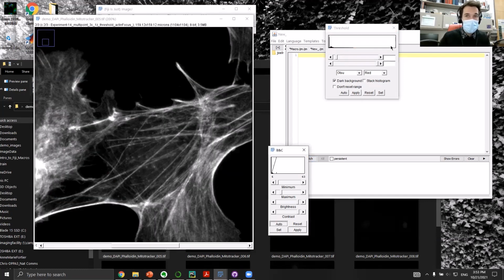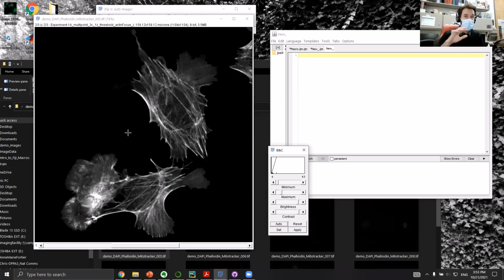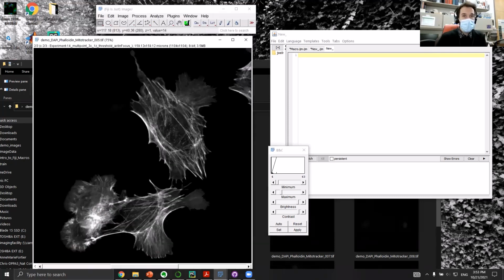So in cases such as this, it does happen that you'll have to do a little bit of manual analysis, and that's fine. That can be either because it's too difficult to write something, or you're just starting out, you're just getting images, and you just need to get a little bit of data from 10 cells or 20 cells. So maybe you want to know what's the intensity of the actin fiber that's going in the middle here, the one that's most in the middle, let's pretend. And maybe it's something else.